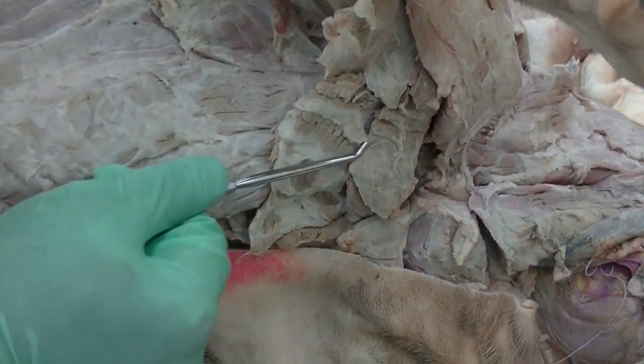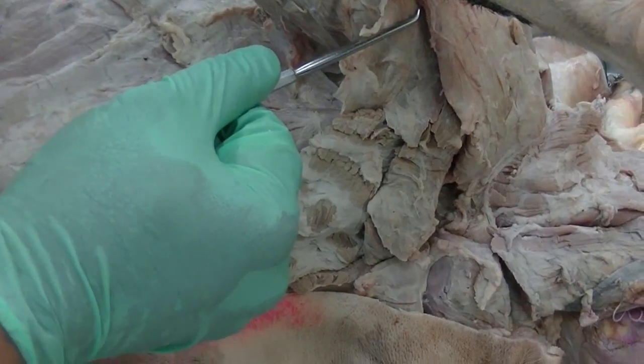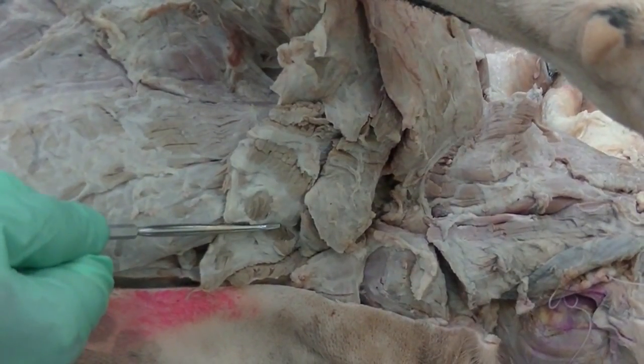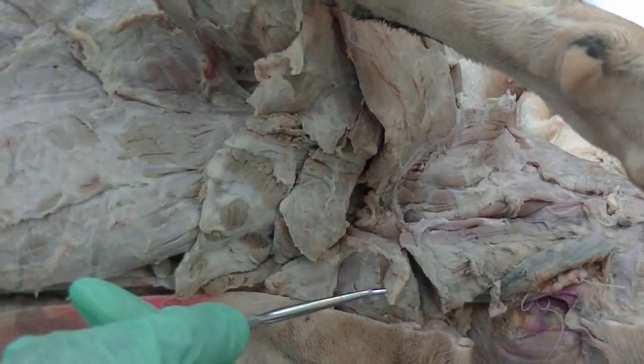The muscle is more flat in nature, and also inserts on the humerus of the arm. This is called the transverse pectoral muscle, as the fiber direction of the muscle is exactly transverse to the median plane, or the main axis of the body.